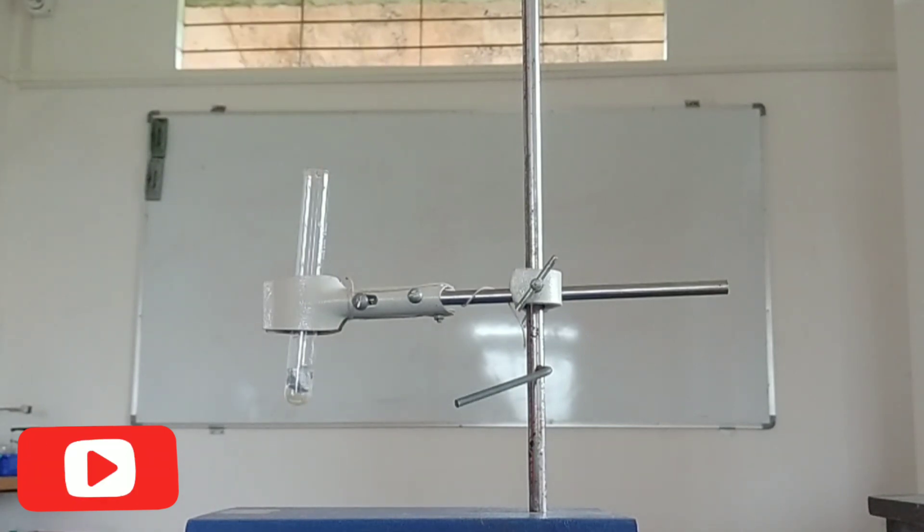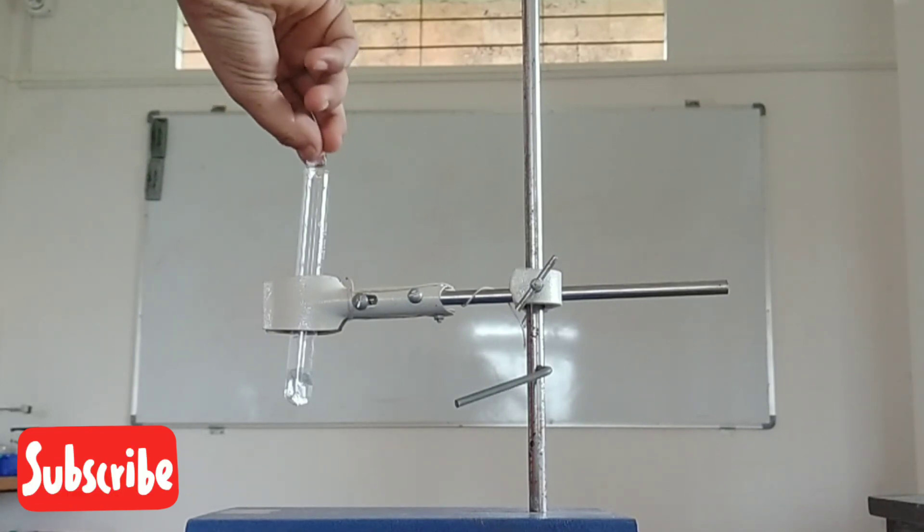How do metal react with an acid? What will happen when metal react with an acid? Let's study this through a demonstration.